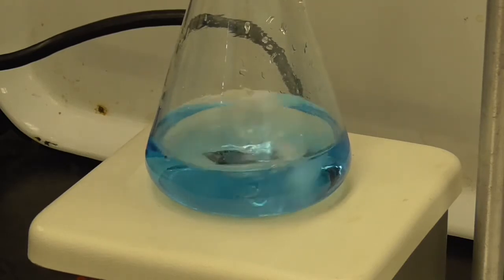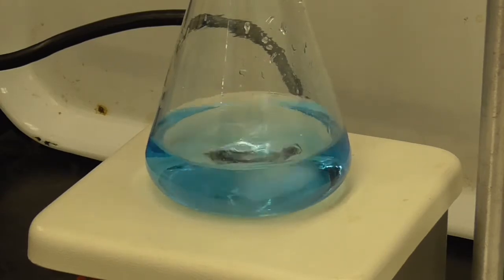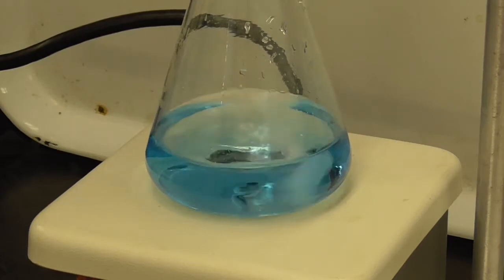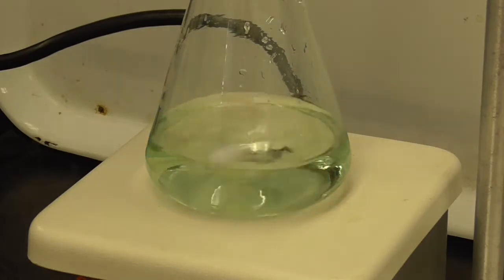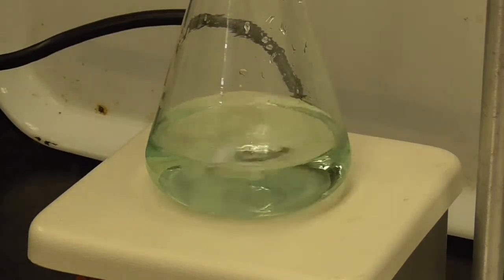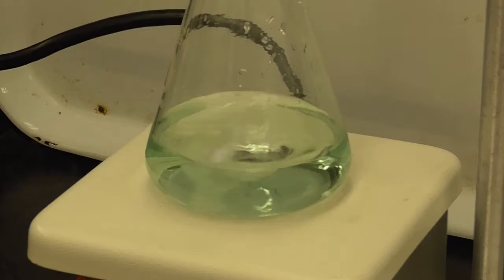Okay, so it's starting to turn, at least where the stuff hits. So we're getting close. This is a very quick, dramatic endpoint, so probably just go drop, drop, drop at this point. There we go, there it is. Okay, that's yellow. It's a little greenish yet. So maybe one more drop. Actually, there's a little bit hanging there, so I'll use the squirt bottle to squirt that one off in there.